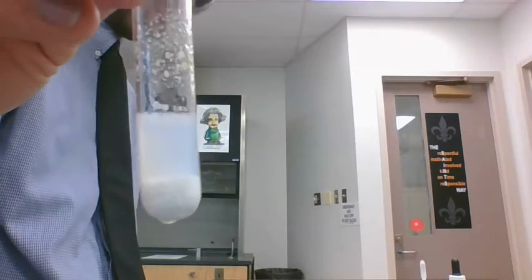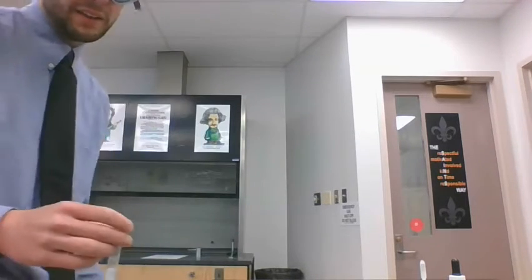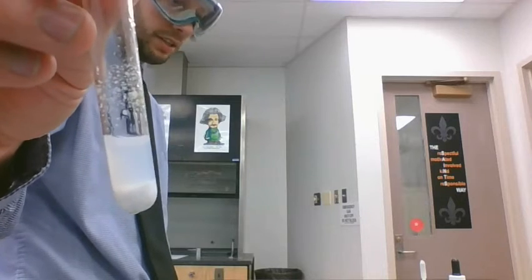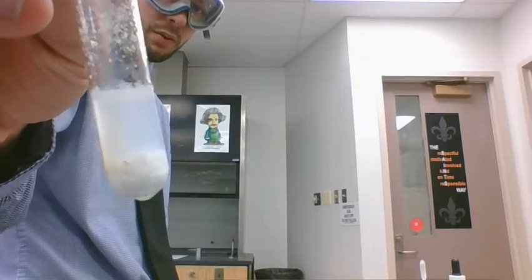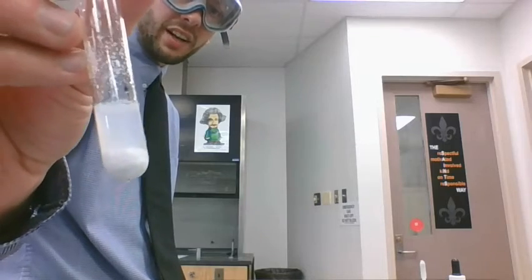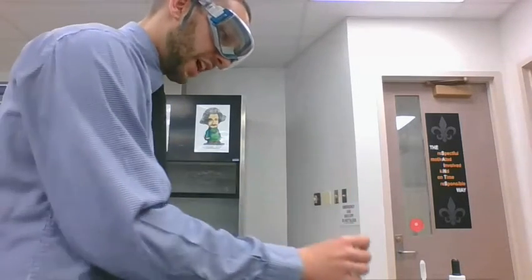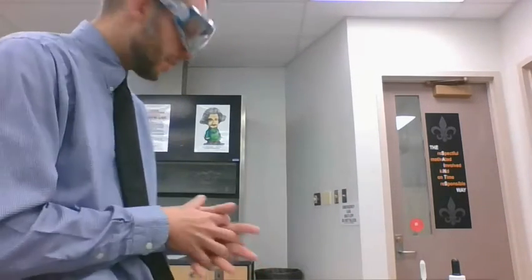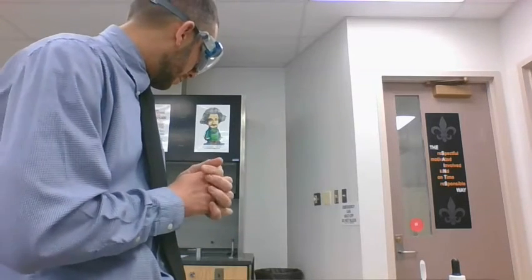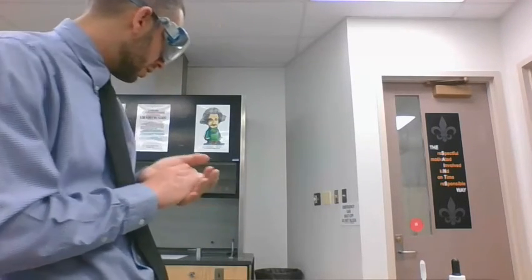So in the second one, we added the two clear liquids, the hydrochloric acid and the silver nitrate, and what we get out of that is a nice white solid. So we made some kind of solid out of those ingredients. Okay, so again, it's up to you guys now to look at the type of reaction, figure out the products, and write in the correct formulas.